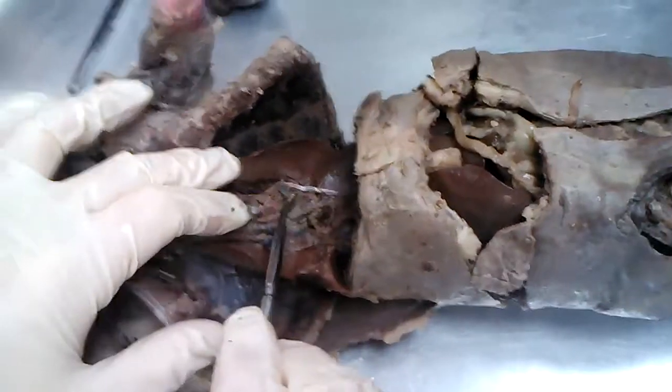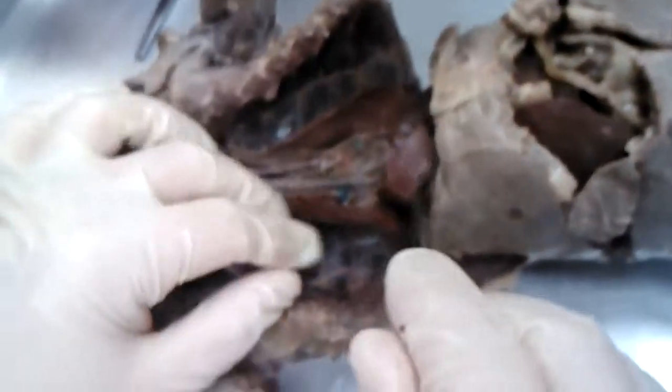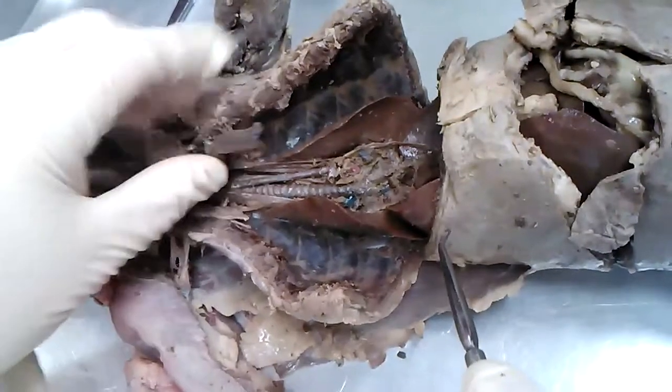Okay? Here's something else you don't see too often. Phrenic nerve, not on your list, but it's kind of cool. So again, that's parts of the mink's lung stuff we saw in the thoracic cavity overall.